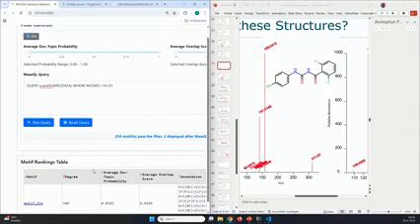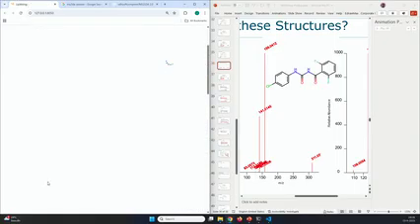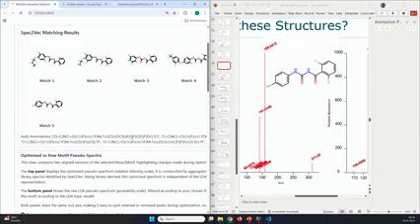So the question was how to know which MZ value to pick. Obviously I know what I'm looking for, so for me it's quite easy. But normally I would aim for the fragments of the highest intensity and check them first. If you find something there, that's a good indication, because in the model we also include the intensity in the modeling, so they have a high probability to end up in a substructure. Aha, wow, it works. That's good.